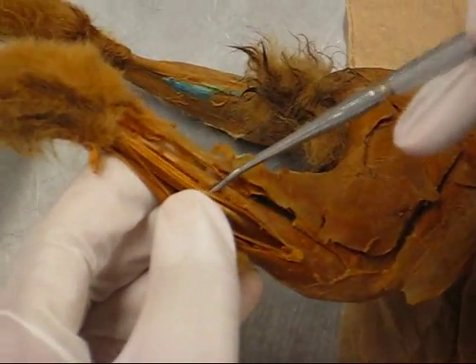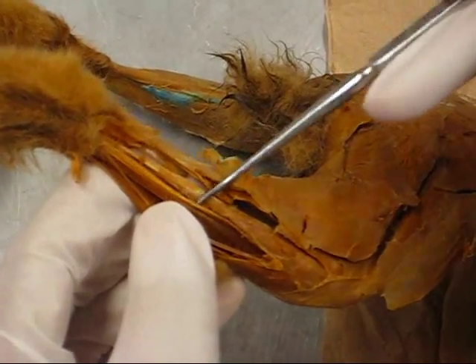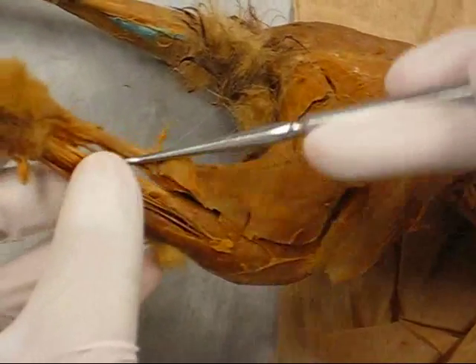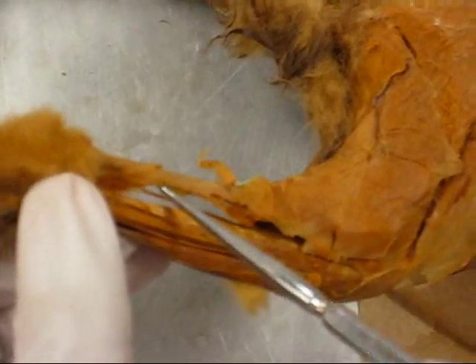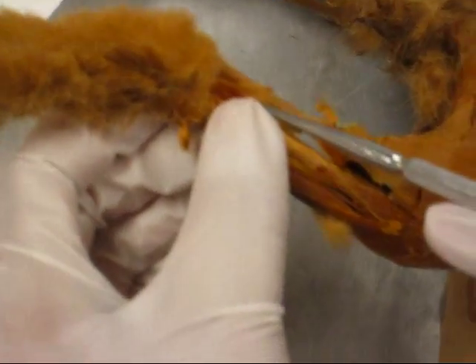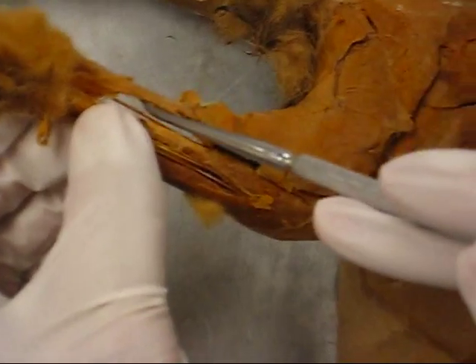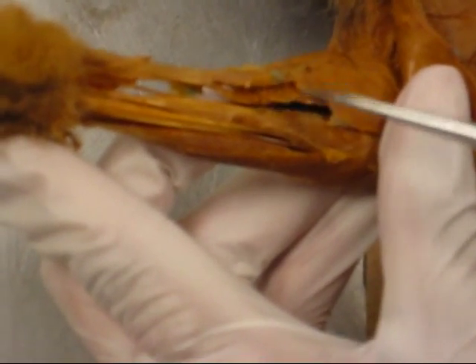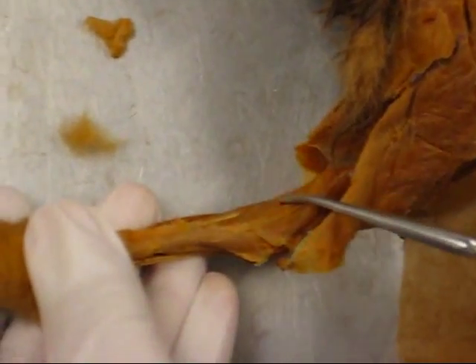And the other one attached to a muscle is peroneus brevis, which is attached to this muscle on the bone. On this side you have the flexor digitorum longus. On this side of the gastrocnemius is the soleus, right underneath the gastrocnemius. Plantaris is on the medial side, underneath the gastrocnemius.